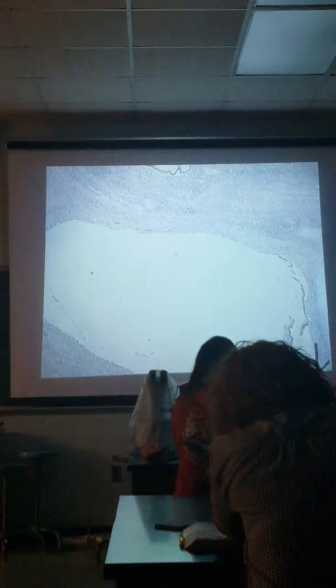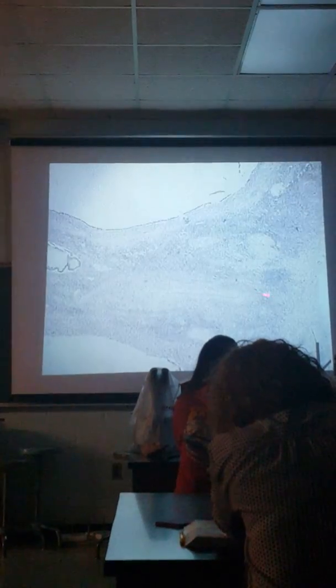This is a remnant. This is corpus albicans. So you can see it kind of looks like there was something there, but it's slowly being absorbed. But you see remnants, kind of like a fossil. Oh, there's something there.